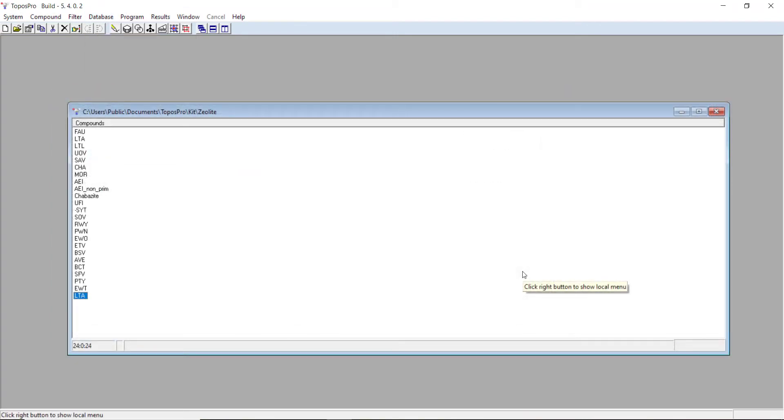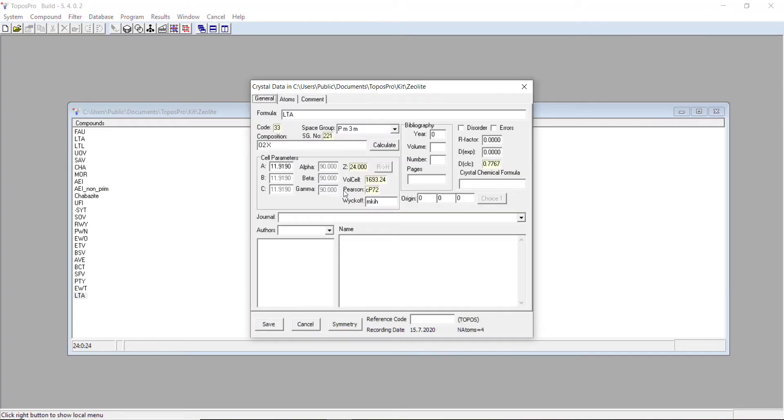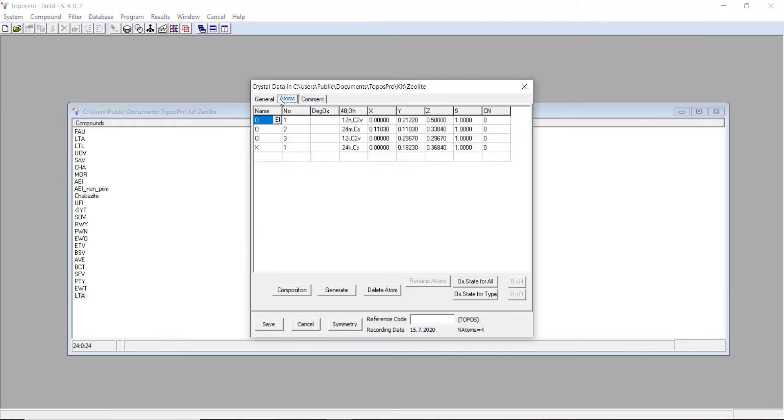Now that I've imported this CIF file into my database, we can double-click and see what the atom composition is. If I go to the atoms tab, you can see it's got all the oxygens and species X because it can be silicon or aluminum, so they represent it with X.